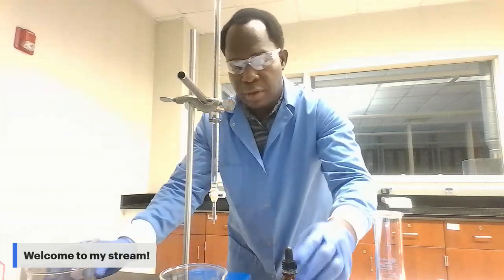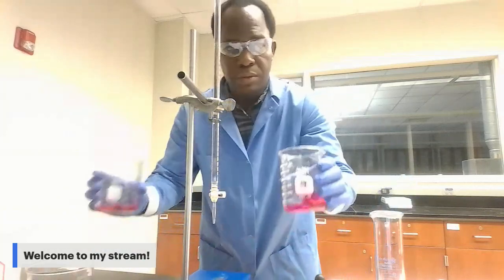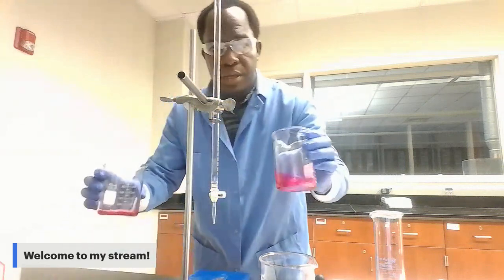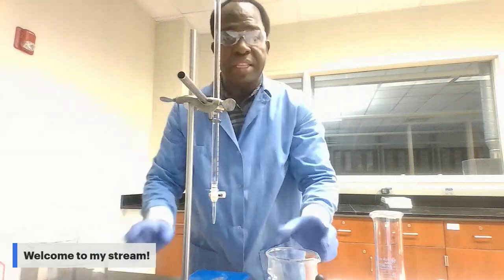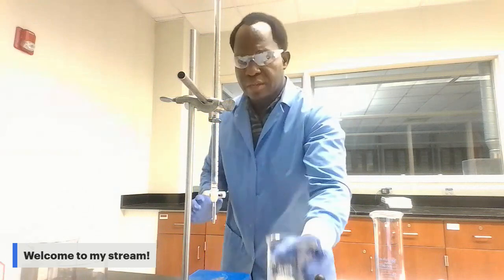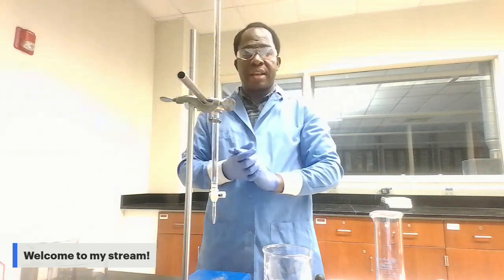Okay, add 5 drops to each beaker. So this is what we have, 3 beakers. Okay, now I'm going to proceed to the titration part. We are going to titrate each solution with HCl.